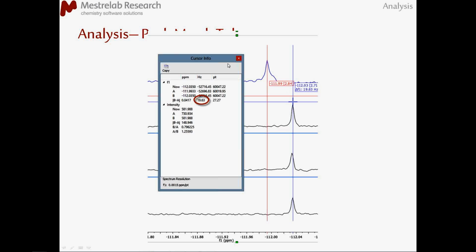So remember this when you are switching from proton to fluorine. We'll see, like I was saying, a few samples later on. Okay, so the one thing that I mentioned that I really don't want to get into at all, and hence I'm not going to, is that for each different system, each different target protein family, there are going to be different considerations on what we are going to call a hit.